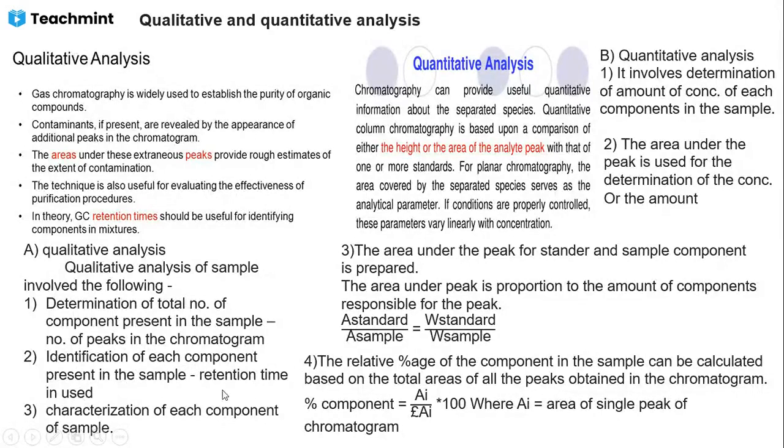If you know the retention time, then you can identify which component is present, and as many peaks as appear, that many components are present. Then characterization of each component of the sample. Okay, the same thing is given here.